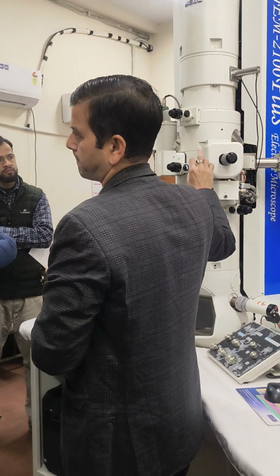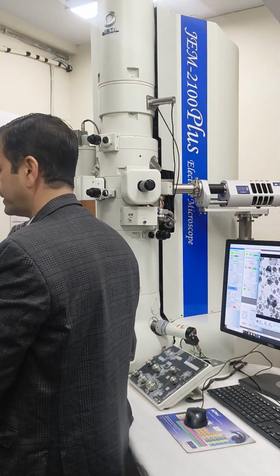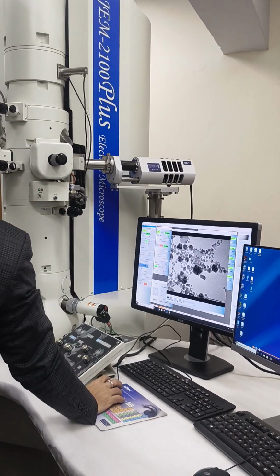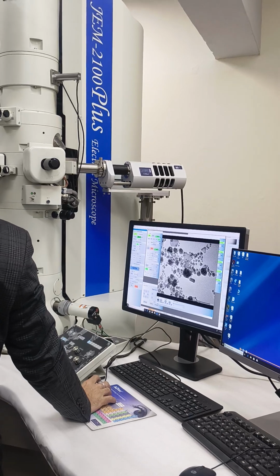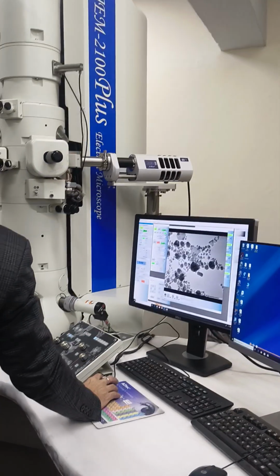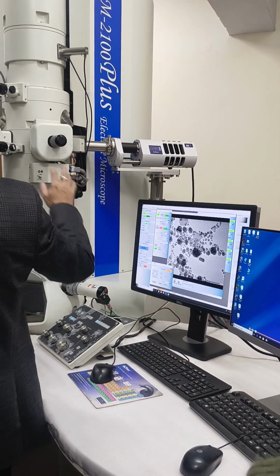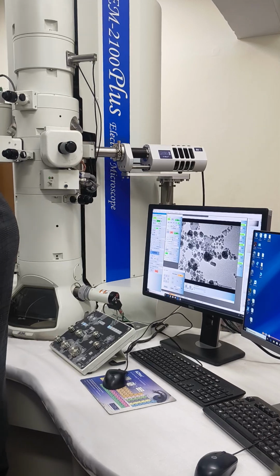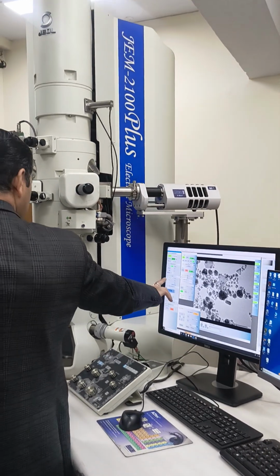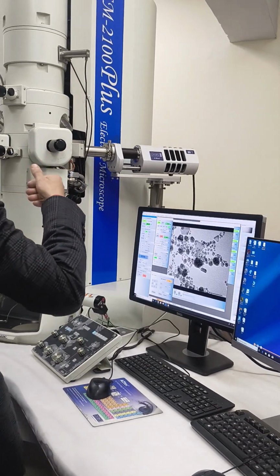This is the sample stage. Here we are going to insert the sample. Right now the sample is inside the machine. Let me show. We have moved the sample somewhere, so now I am putting it to home. The stage is going to home. It was somewhere because we searched something. Now bring it to the 0 position, X, Y, Z, 0, 0, 0.